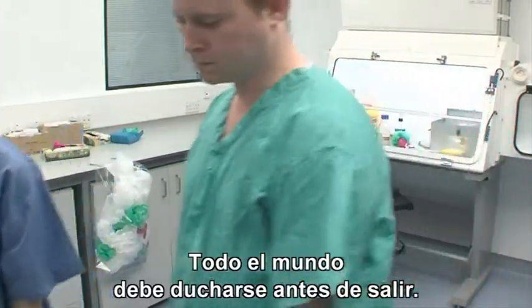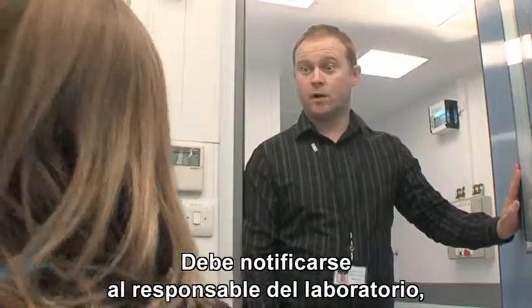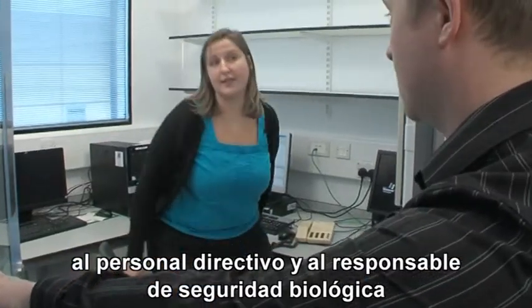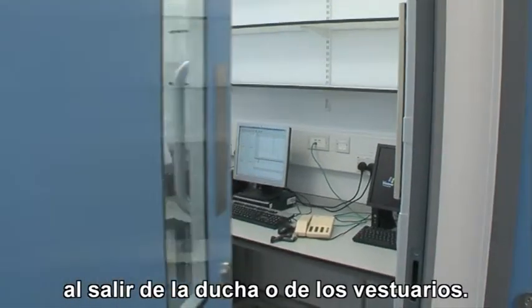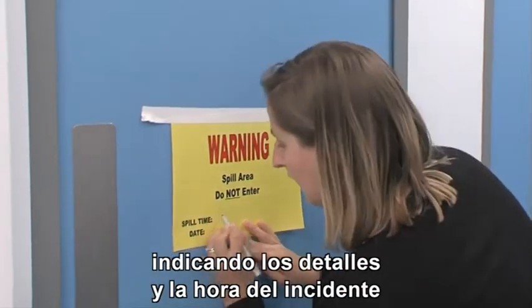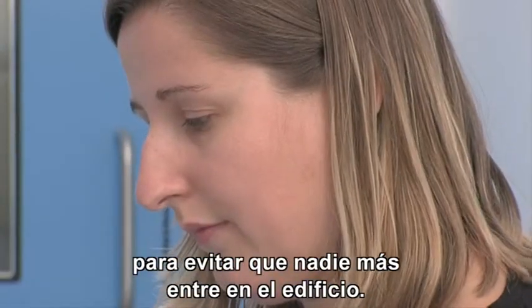Everyone should shower out before leaving. The incident must be reported to the building officer, line manager and local biosafety officer on exiting the shower or changing room facility. A warning sign must be placed on the shower doors showing the details and time of the incident to prevent anyone else entering the building.